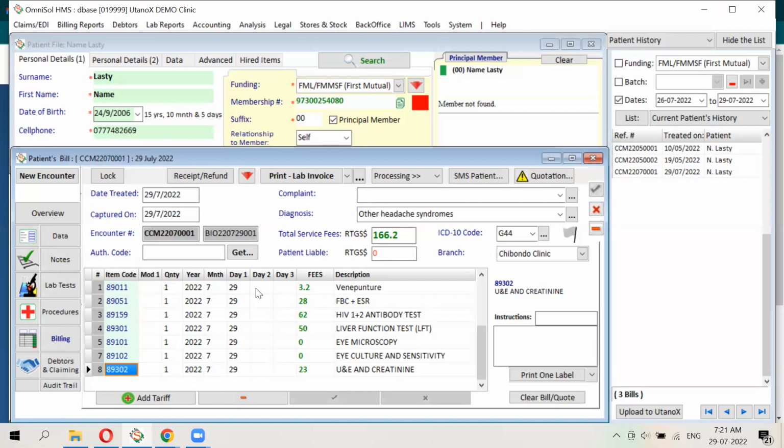This is now a lab specific configuration. You actually configure the system as to how you want to do it. By default, it would have that definition of tariff codes or billing codes attached to the profile. If you want it to then also lock in the individual billing codes to the individual tests in the profile, then we also can make that setting as well.